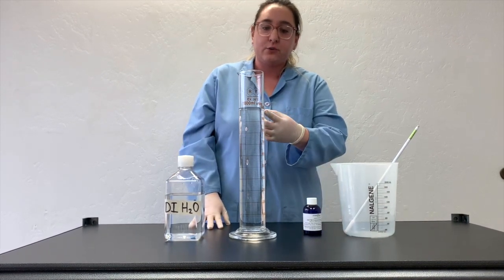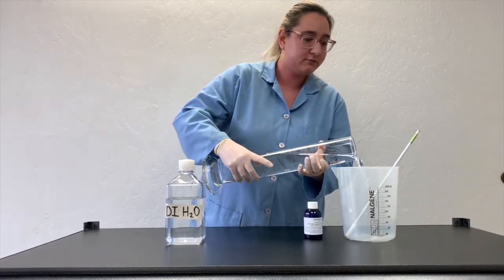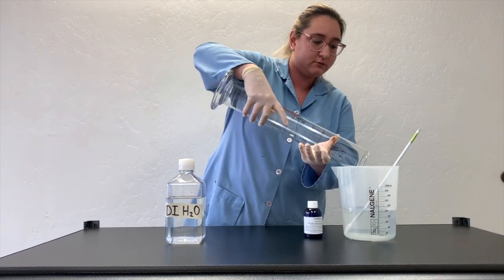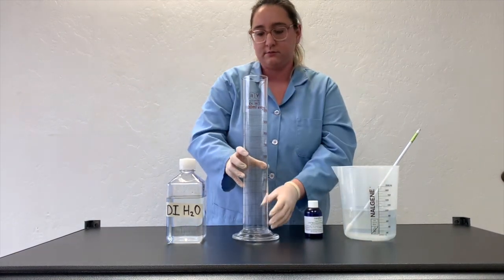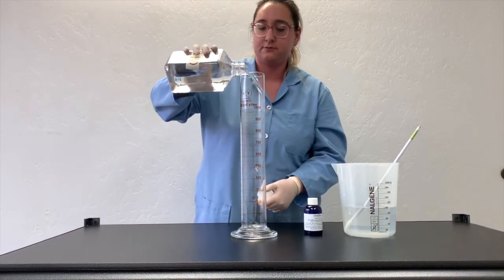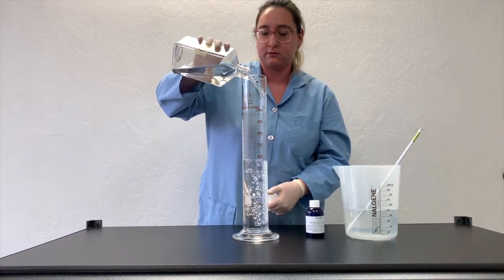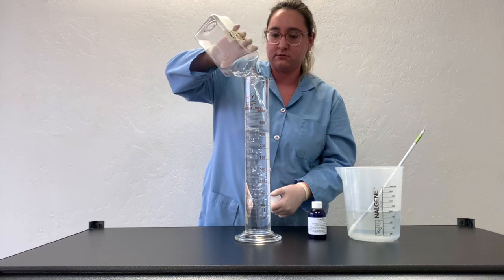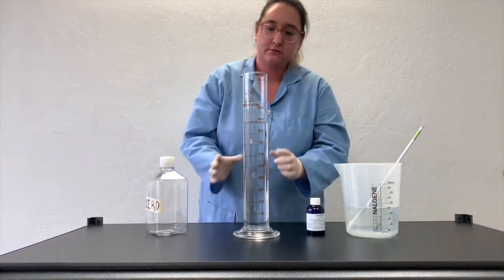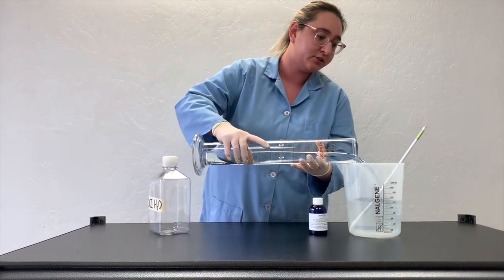Here I already have 1,000 milliliters of water prepared. Now we add 900 milliliters more, giving you a total of 1,900 milliliters of water.